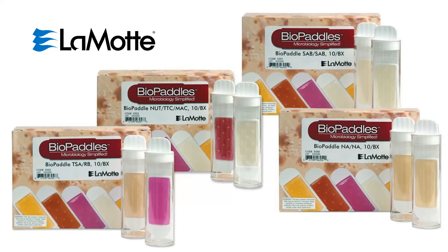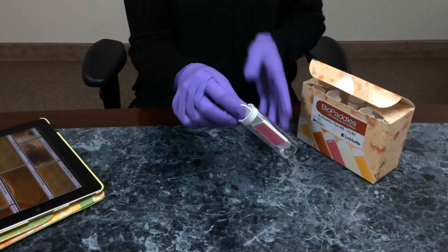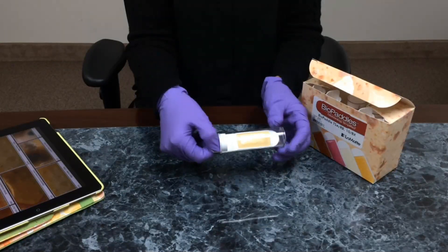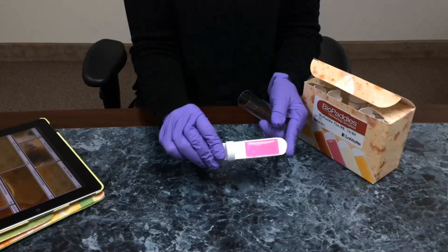Bile paddles are flexible paddles with a microbe-specific media on each side and are enclosed in a sterile vial. Bile paddles are ready to use out of the box and do not require prep. The bio paddles may be stored at room temperature and have a longer shelf life than traditional petri dishes.